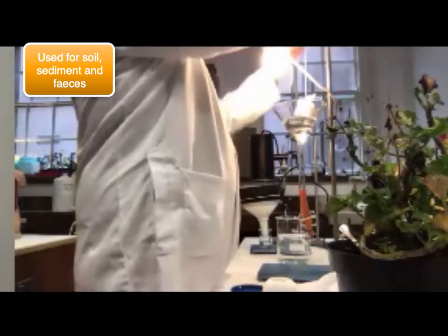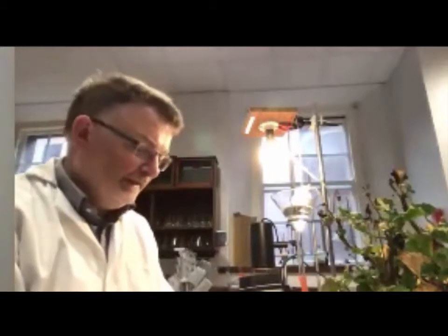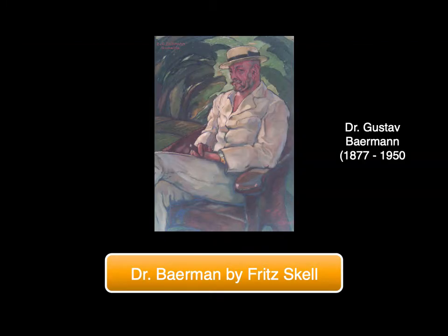So we can raise it up by pulling the light up and down. So there we go. This time we're using this with soil. Of course, this is actually a medical and veterinary procedure, just over 100 years old. It was originally discovered as a way of looking for nematodes in the medical and veterinary context. That's kind of gross, because instead of soil in here, they would have been putting stool samples, feces of animals or humans. The original worker was a fellow called Baermann. So there's two systems for looking at soil organisms.